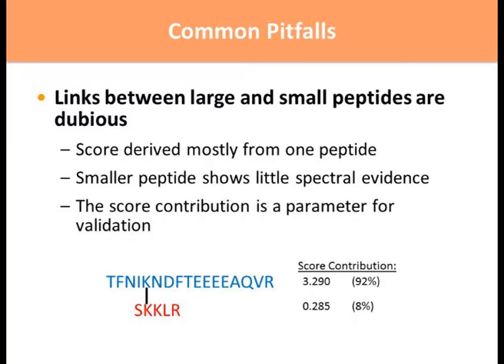Therefore, if we look at the actual score contribution of each peptide in the analysis, the large peptide is going to contain the bulk of the score. The small peptide, very little. This very small score contribution might mean that it doesn't make it into our 500 or 1,000 peptide list cutoff in the two-stage analysis, or it could mean that some other peptide that is also small and of similar mass might have a very similar score and therefore not create much separation in total score between this correct PSM and some alternative. All of those make analysis difficult, and these are common problems for everyone.